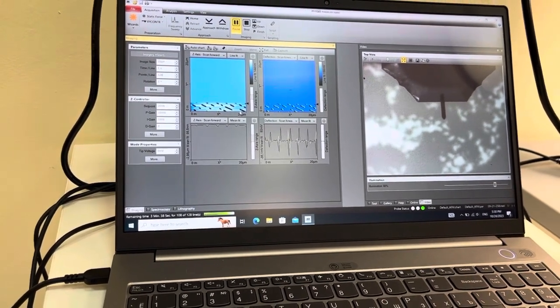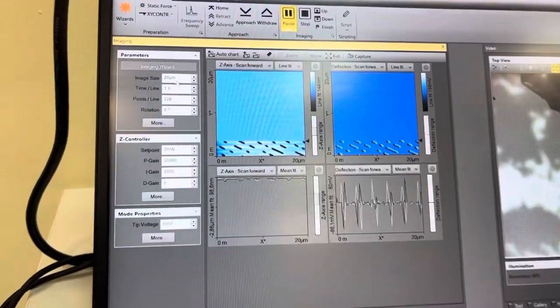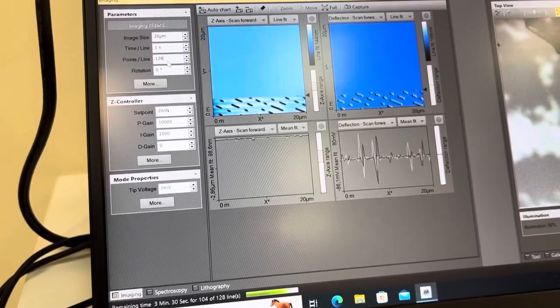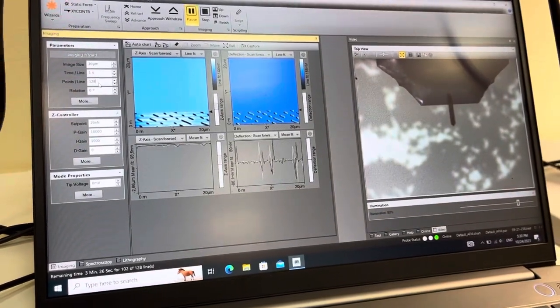Then you have to select and change the image size here. For point lines, I think you can put it to 256, and then you can start measuring.